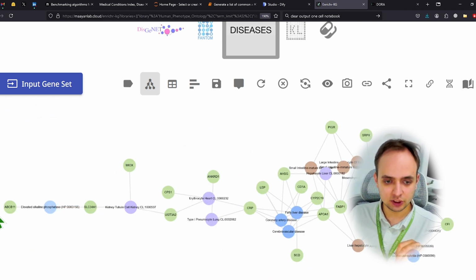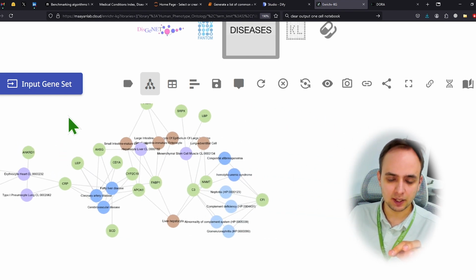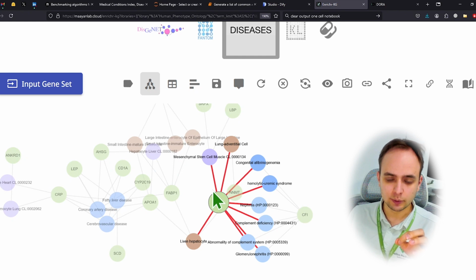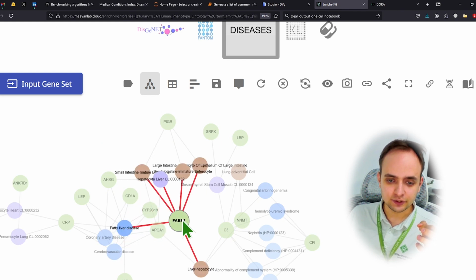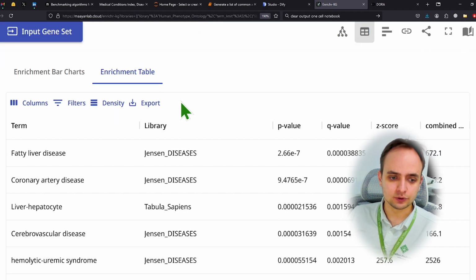So some of these genes are connected to just 1 or 2 terms, nothing interesting, but here we have a very dense cluster of genes with some complement proteins, NAD metabolism proteins, and other proteins which are connected to many different categories. What categories are those?